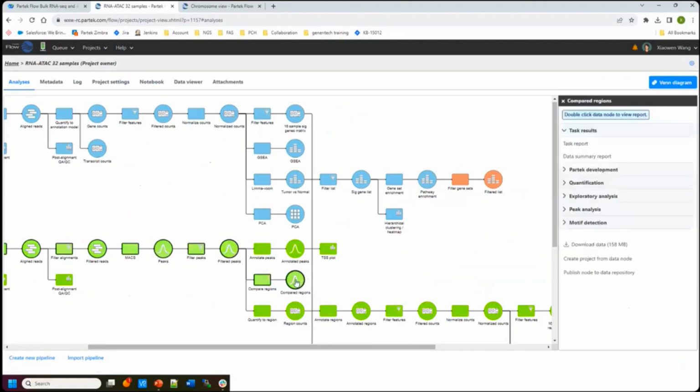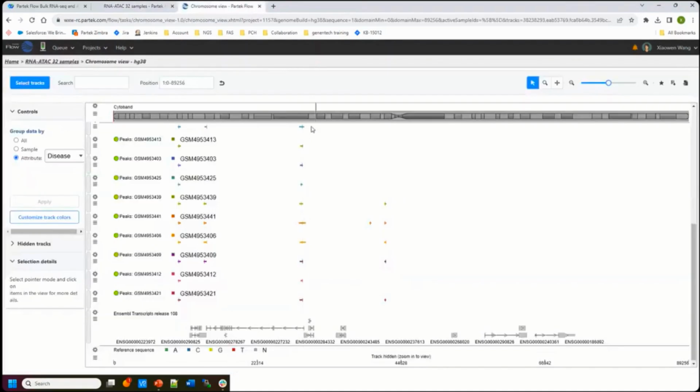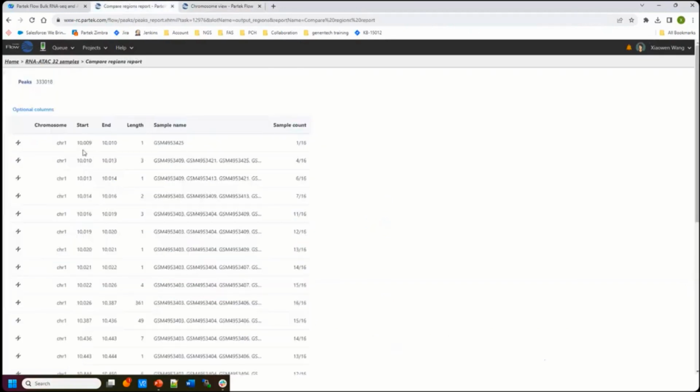This result will compare all your samples, all the regions. Basically, we just join all the breakpoints of all the regions and give you the report. Say, okay, this region. You can see when you chop it up, the read length, sometimes maybe this is just noise, right? This one base pair is happening in this one sample. Probably because in this sample we detected a little bit longer than the other. And next to that, we got 3, it's only 3 base pair. There are 4 samples out of 16 detected, right?